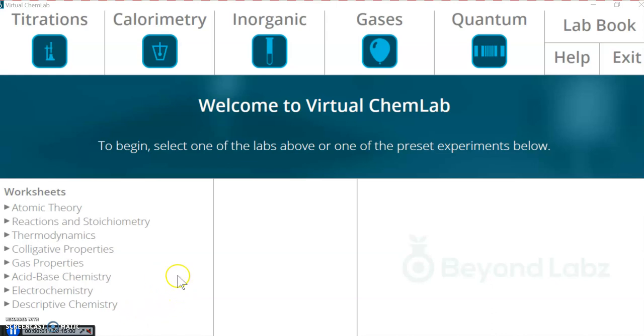Hello, this is Brian, and today we are doing the Beyond Labs lab called 8-3, Identification of Cations in Solution: Silver, Mercury, and Lead.